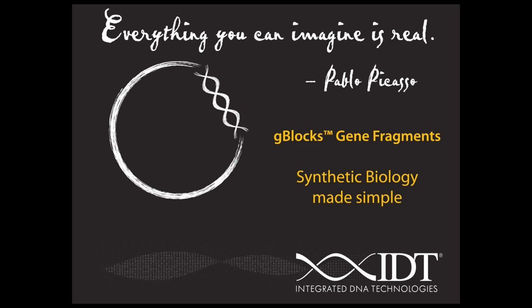The next question for that would be, is it going to be stable in bacterial cells, if indeed they need to be transformed into bacterial cells? And that tends to be a big stumbling block for a lot of people, and frankly for us as well when we're making genes. Bacteria like to recombine things, and particularly if things are in high copy plasmids, the chances of recombination are quite high, and so these tend to be fairly unstable. Now, there are some tricks that we could use. There are certain cell lines that tend to work better, and there are some low expression plasmids, if they're going the bacterial route, that could help minimize the chance of recombination with something like this, if they do indeed need to express this in bacteria.